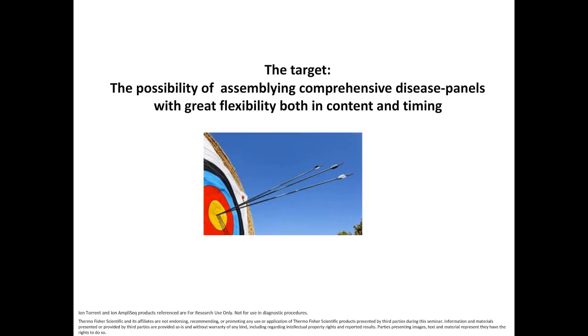So when you're looking at making sure that you have enough coverage, it's not only about making sure that the exon region is covered by the amplicon, but it's also understanding how well that is covered. So the actual overall coverage metric, which is not to be confused between in silico coverage versus expected coverage. Those two factors have a tendency to get confused.